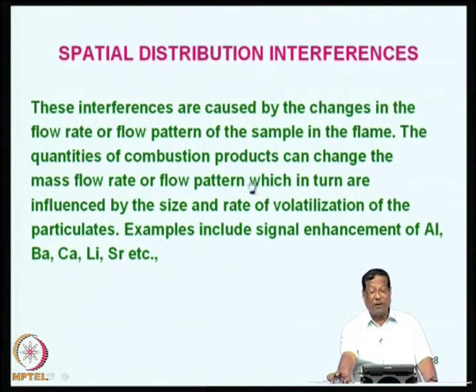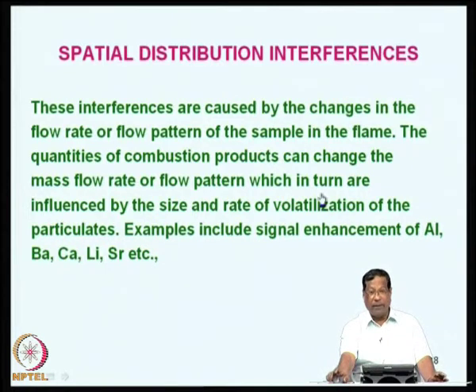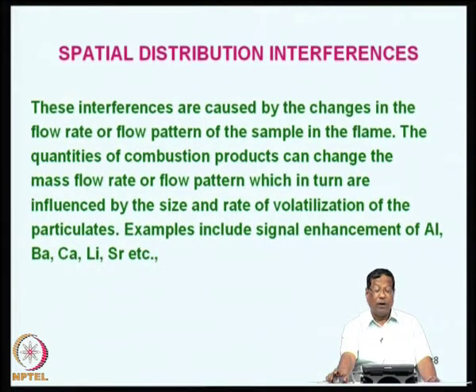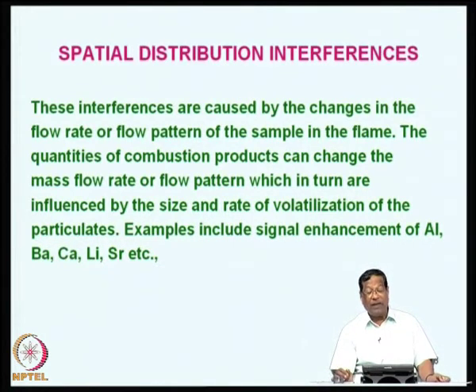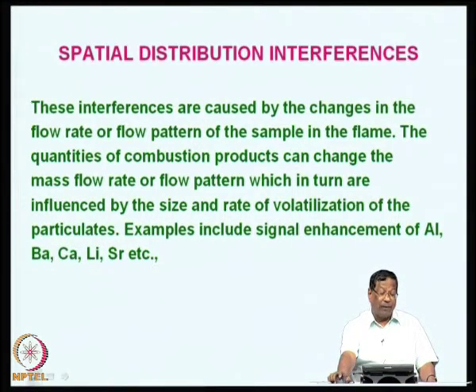There are other types of interferences: spatial distribution interferences. These are caused by changes in the flow rate or flow pattern of the sample in the flame. The quantities of combustion products can change the mass flow rate or flow pattern, which in turn are influenced by the size and rate of volatilization of the particulates. Examples include signal enhancement of aluminum, barium, calcium, lithium, and strontium.